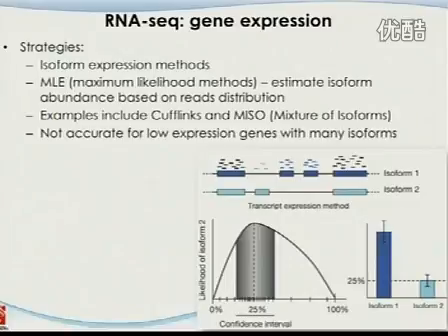Okay, and the general strategy is that I'm going to start from those reads that are unique to each individual isoform. I'm going to estimate this. But that is only my point estimation, meaning that I don't have a confidence interval. I don't know what the range of it is. Then they further use a statistical approach to reallocate the reads in the constitutive exons into different isoforms. Okay, and this is more like a statistical inference issue.